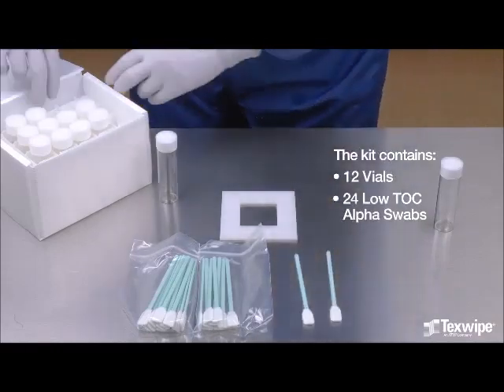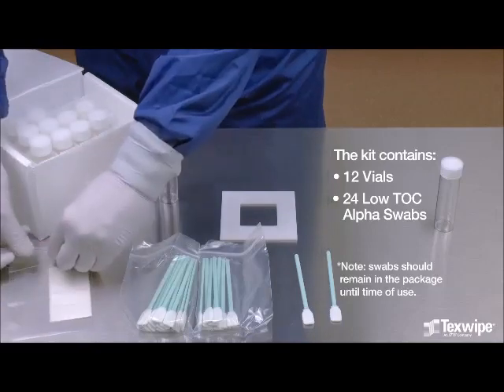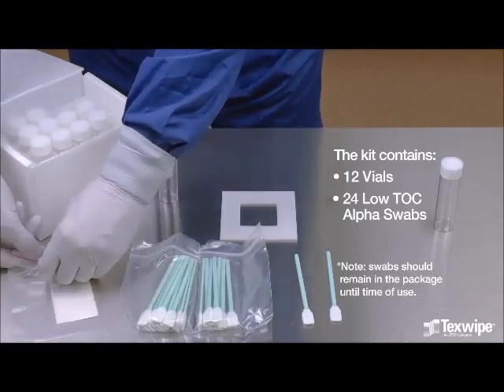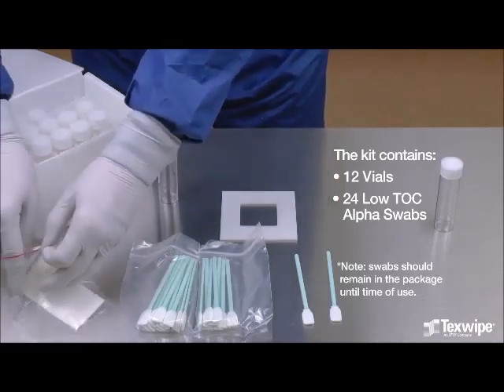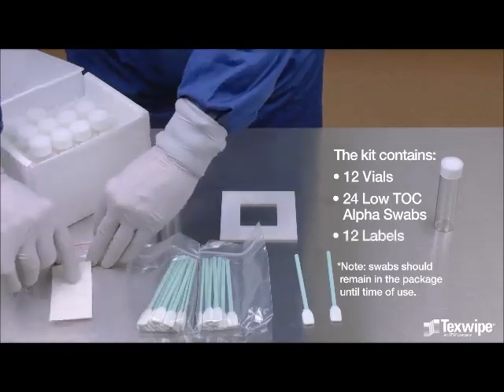Two swabs are used for one sampling procedure. Note, the swabs should remain in the package until time of use. There is a cleanroom compatible label for each vial in the kit.